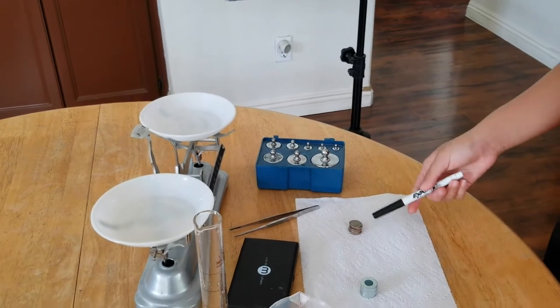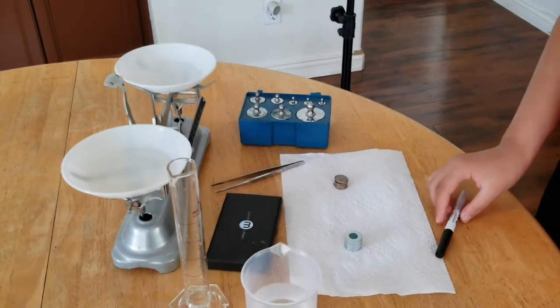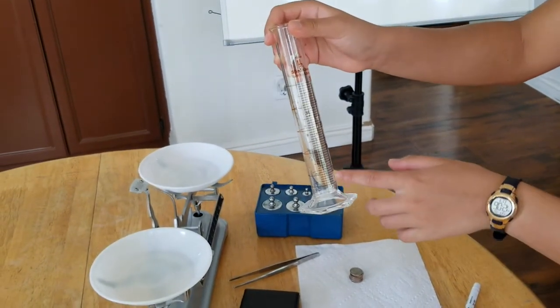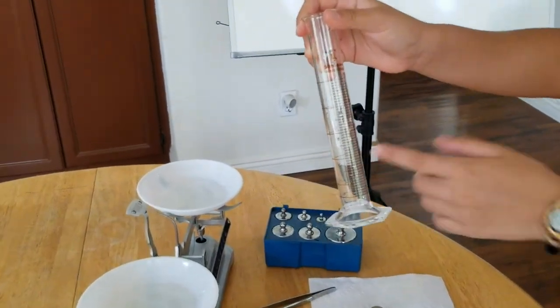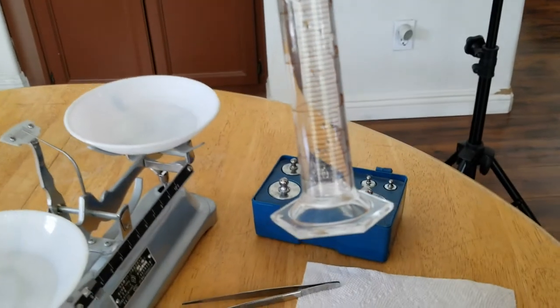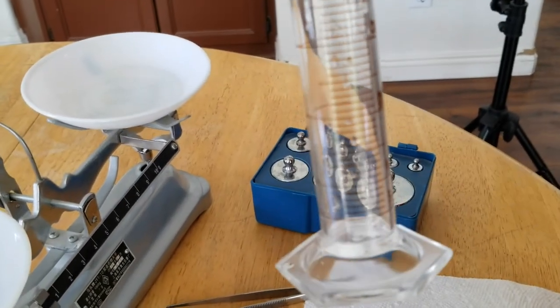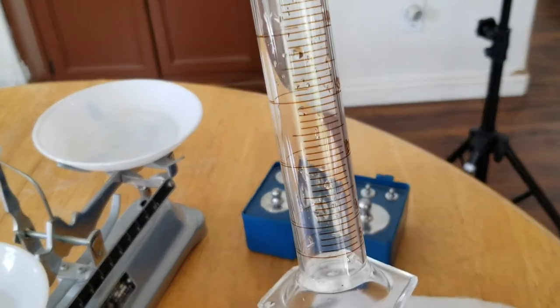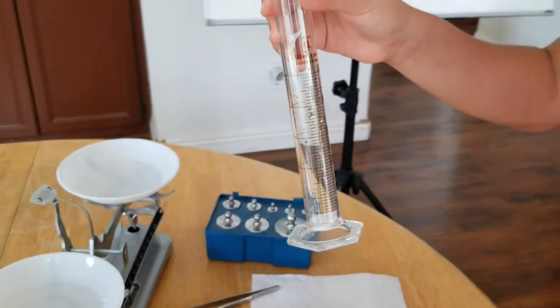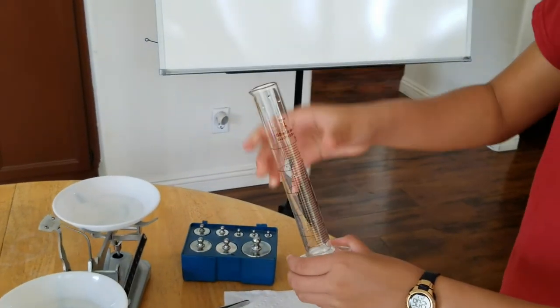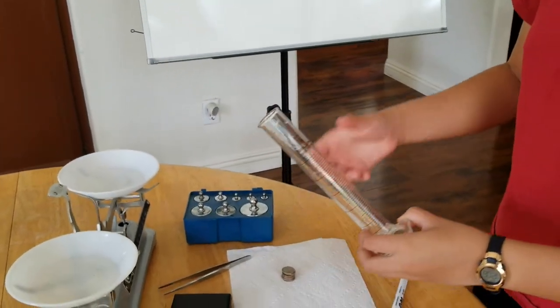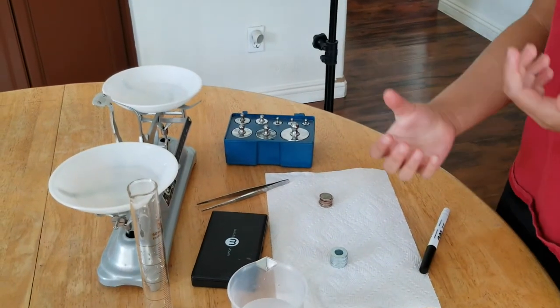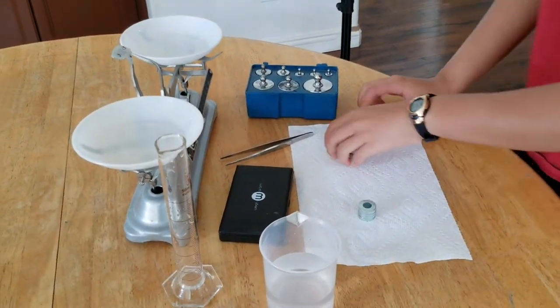So you might be wondering why we have 10 instead of just one. The reason is because if you look at the graduated cylinder, it's not very accurate, so you can't see very small movements. If you just dropped one dime in there, the water wouldn't move up very much. So instead, we're using 10, and don't worry, the ratio will still be the same. Okay, so let's start.